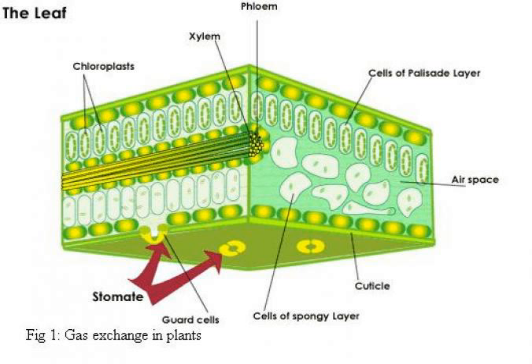Count the number of stomata on each cast. To successfully count the number of stomata in a field of view, you will need to adjust the diaphragm and focus using the fine adjustment up and down to bring different planes into focus. Record your data on Table 1 of your handout.